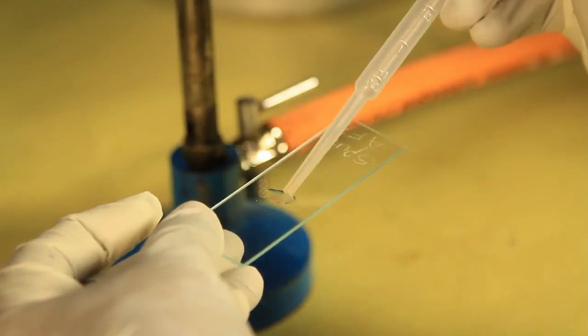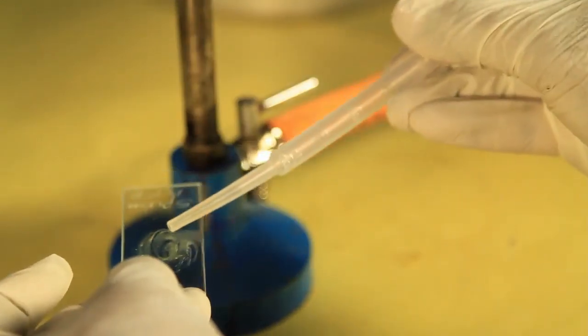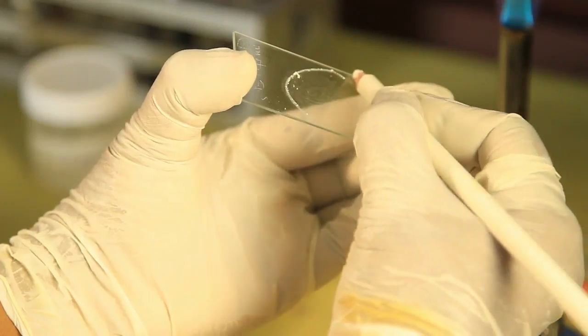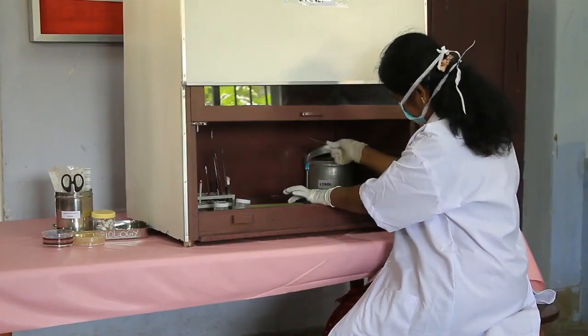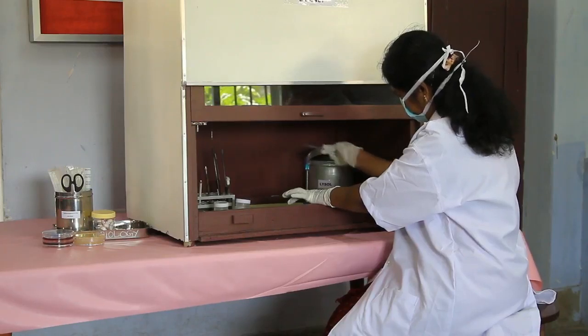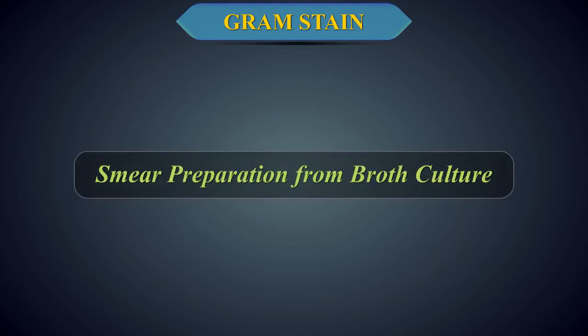Spread the sample to obtain a smear of medium thickness. Let it air dry. Mark the position of the smear on the undersurface of the slide with a glass marking pen or pencil. Heat fix the smear by passing over a flame for 2 to 3 seconds, taking care not to burn it.